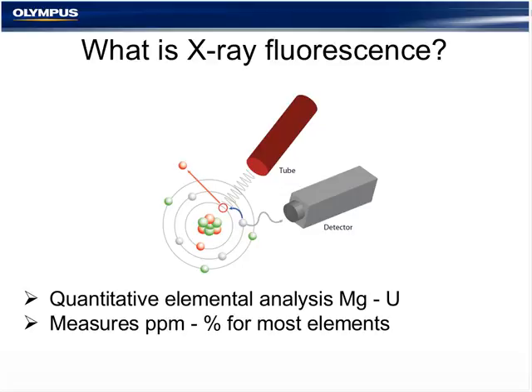Quantitative element analysis, typically magnesium to uranium. It can measure from the ppm level to percent level for most elements.